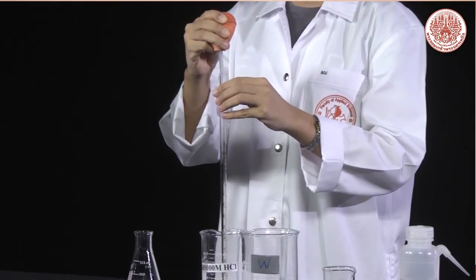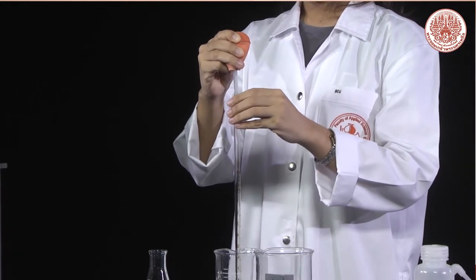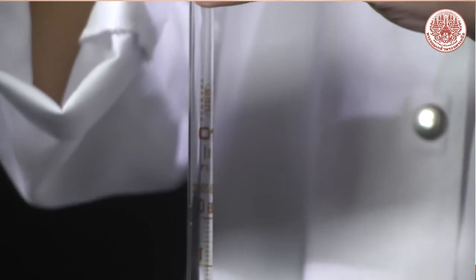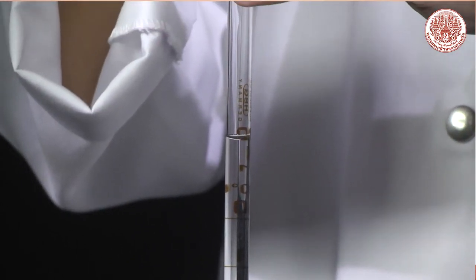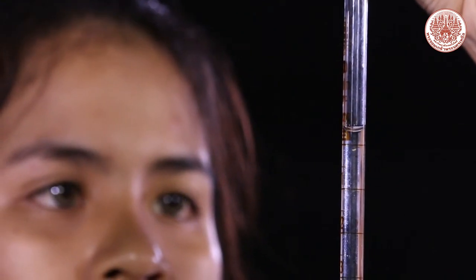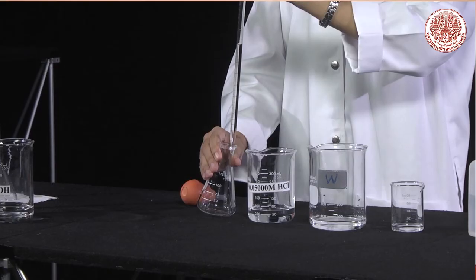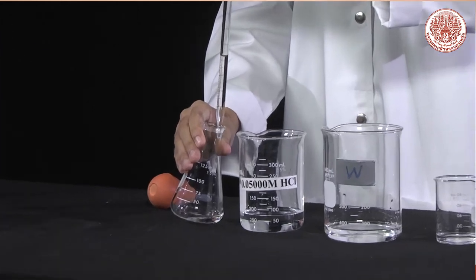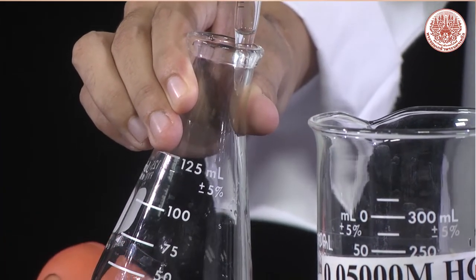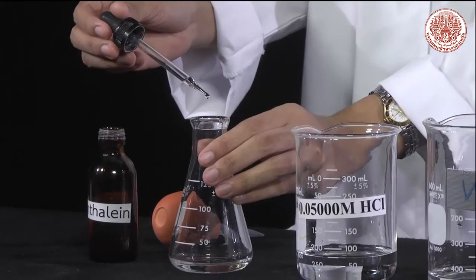Now, time for pipetting by drawing the acid solution into the pipette. Allow the solution to rise above the graduation mark. Adjust the volume to the graduation mark. Transfer the solution to an Erlenmeyer flask through the surface of the flask. Add 2 drops of indicator.